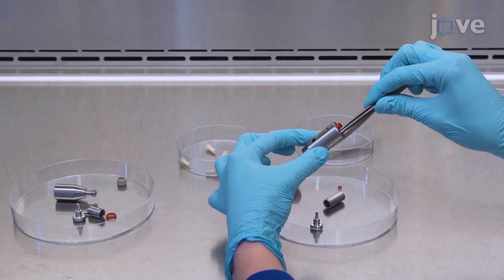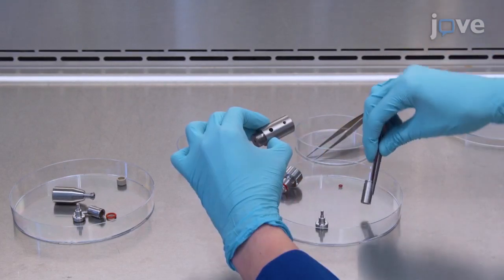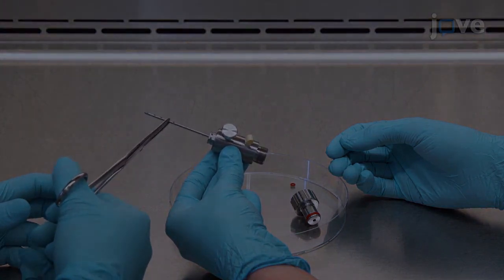Construct the bottom compartment and make sure that the O-ring is properly placed. Place an adapter bushing in the upper part of the bottom compartment and place the pressure conduit with holes through the bottom compartment.